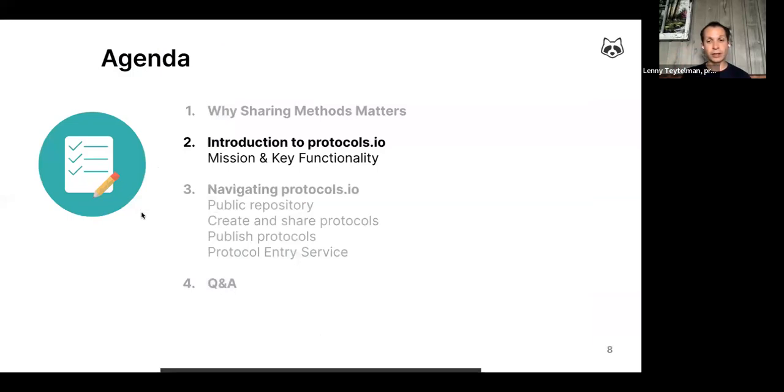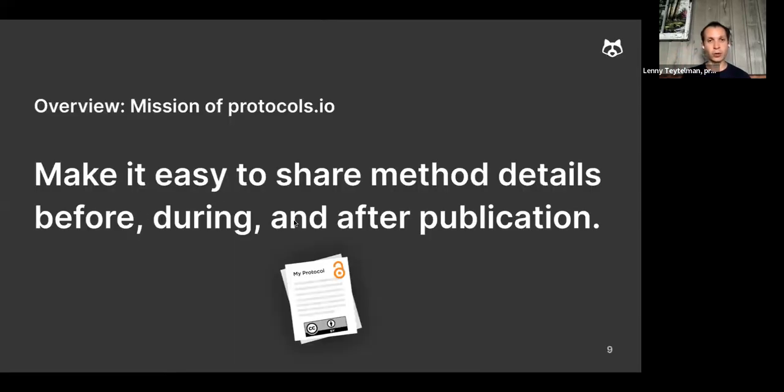And so the mission of protocols.io is to touch on all stages of the research cycle, not just on the publication. So our mission is to make it easy to share those method details as you're doing the work, before, then during, and after publication.